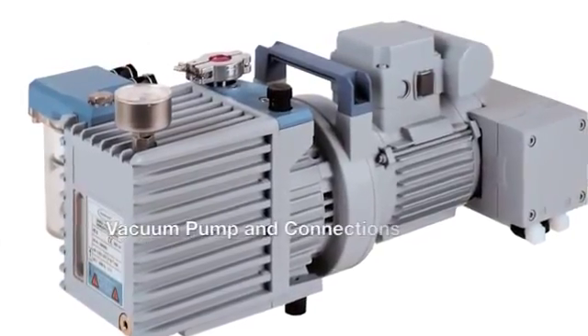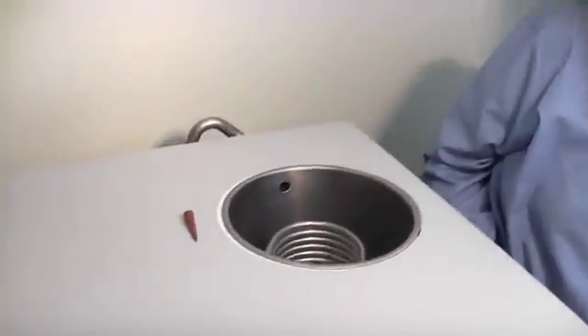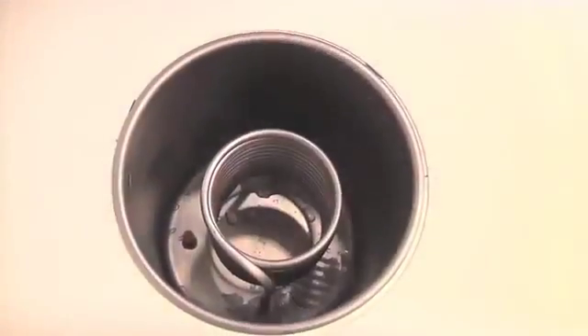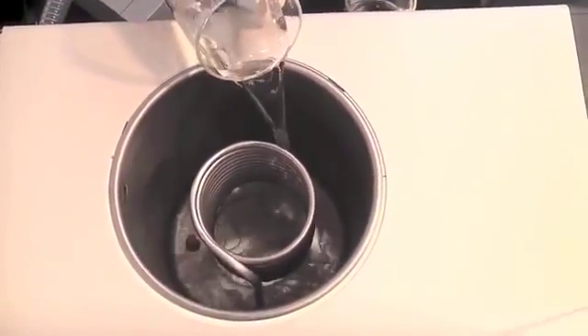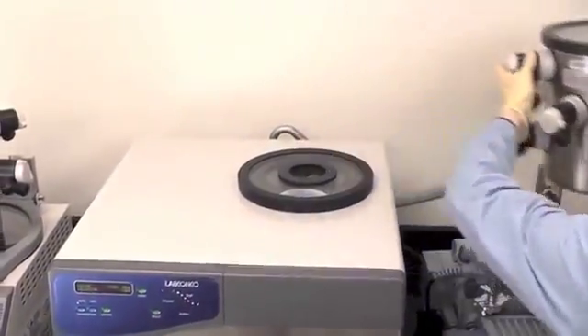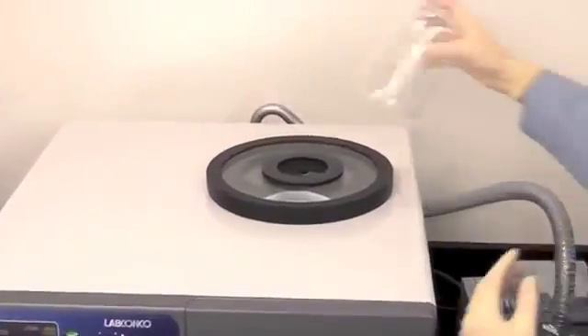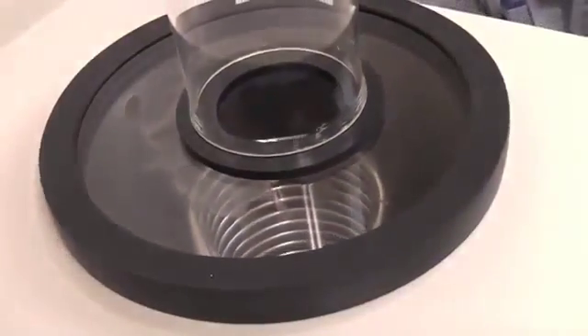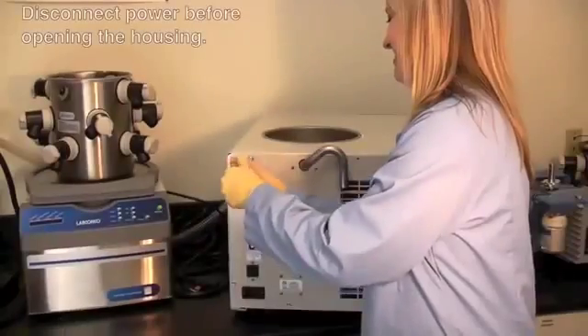Follow these steps to check the collection chamber integrity and connections: using a rubber stopper, plug the drain hole. Fill the collection chamber with approximately two inches of water — enough to cover all fittings — then replace the collection chamber lid and turn on the vacuum pump. On the 1-liter, 2.5-liter, and 4.5-liter models, place the O-ring over the hole and invert a 600 milliliter flask over the O-ring. Allow the vacuum pump to run for approximately 5 to 10 seconds; if left on longer, the water will begin to boil and the test results will not be correct. Look inside the chamber for any bubbling while the pump is running and after shutting the pump off.